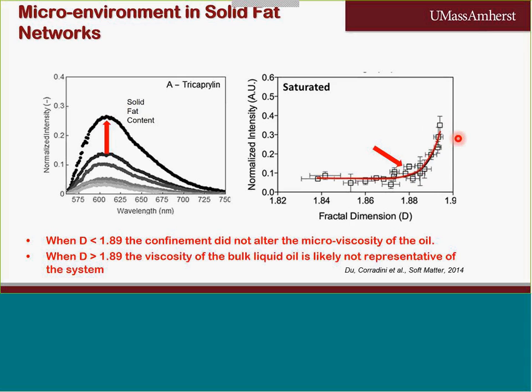And the technique that allows us to figure out what happens with microviscosity during entrapment would be a plus in order to develop materials with desired characteristics and stability, especially in terms of fat blooms.